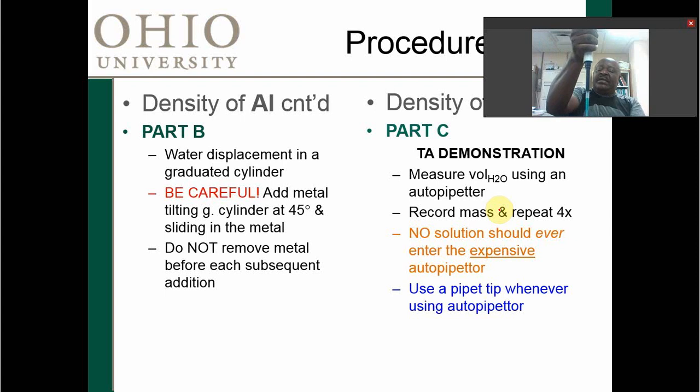And then to pump out, you can pump out a number of times until you get everything out. So here's the deal. For totally reliable results using auto pipetters, check that the volume there is correct, because it's a variable volume. If you're putting in 1 and this is set at 0.7, it's not going to work. So check that. In this case, it's 1,000 microliters showing there.